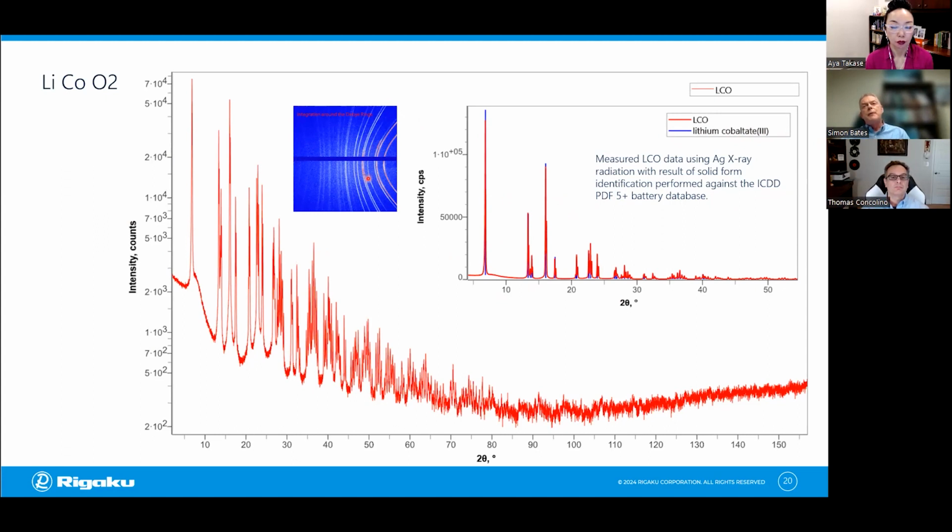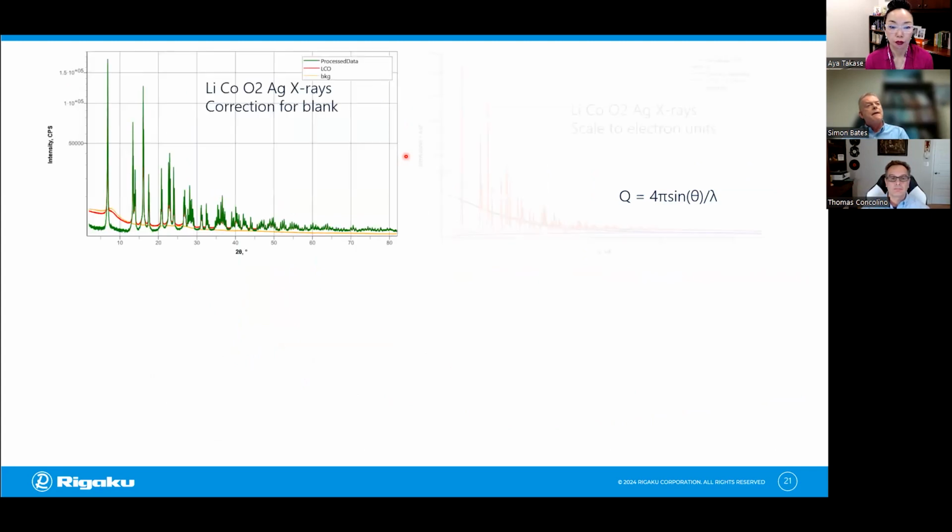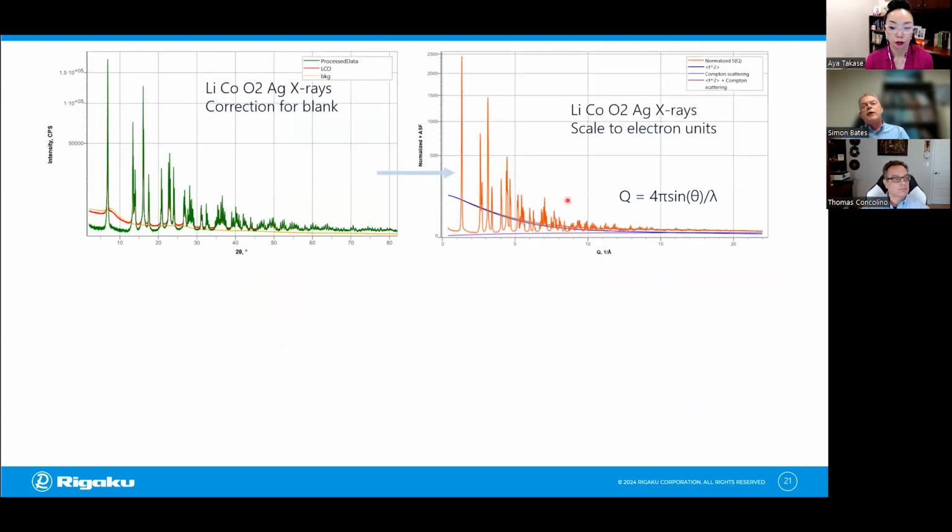And this picture is just to remind me about total diffraction. If you're using an area detector, which is recommended for PDF, then you integrate around all the Debye-Scherrer rings to make sure that you are indeed getting a total diffraction pattern. So we have Q, it popped up there. So now you can see what Q is. This is 4 pi sine theta over lambda, where lambda is the X-ray wavelength, and theta is half of 2 theta, which is the diffraction angle.